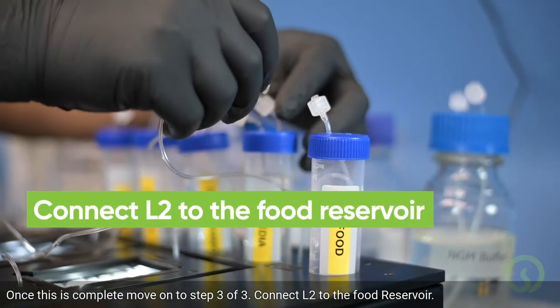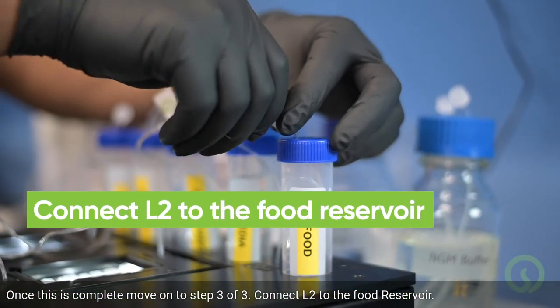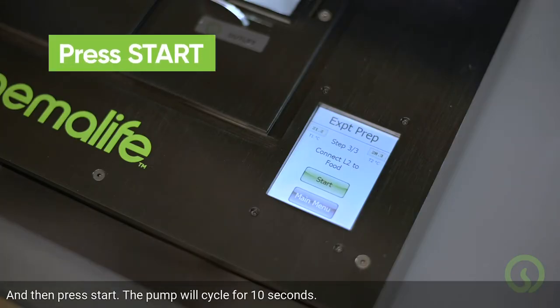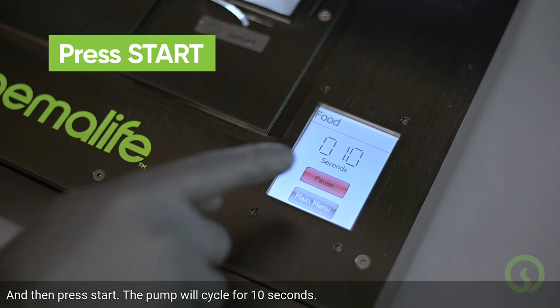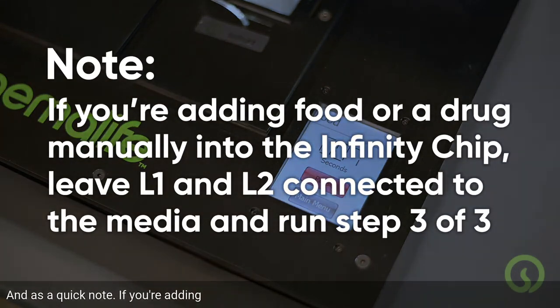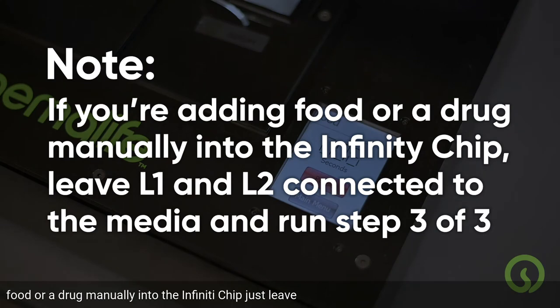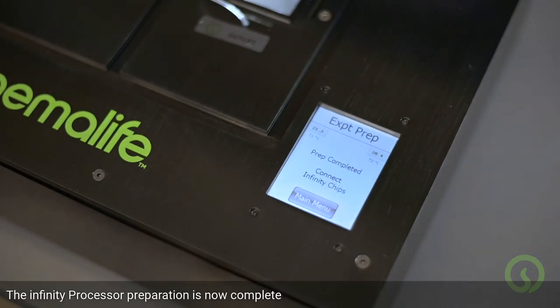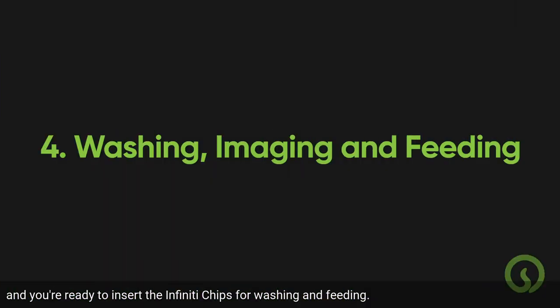Connect L2 to the food reservoir and then press START. The pump will cycle for 10 seconds. As a quick note, if you're adding food or a drug manually into the Infinity chip, just leave L1 and L2 connected to the media when you run step 3 of 3. The Infinity processor preparation is now complete and you're ready to insert the Infinity chips for washing and feeding.